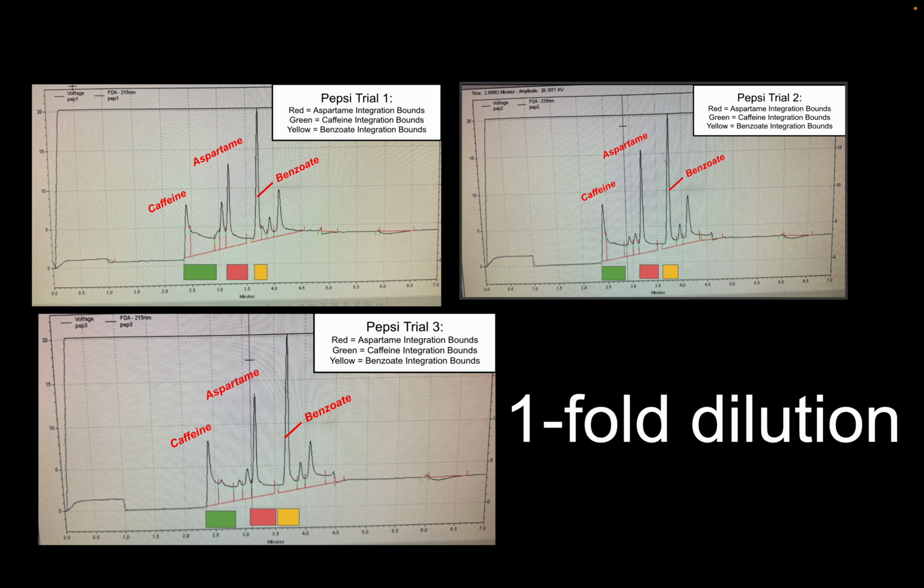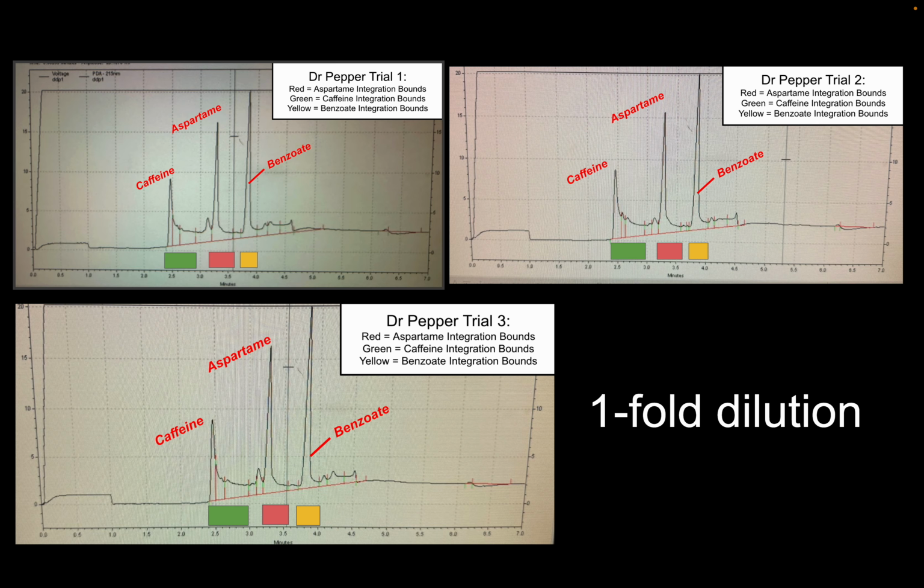Although benzoate came out great. Benzoate gave amazing resolution from the baseline and other peaks. Dr. Pepper, similar thing. We won't get down on this hill too much. I just want to show you the different kinds of peaks I got.